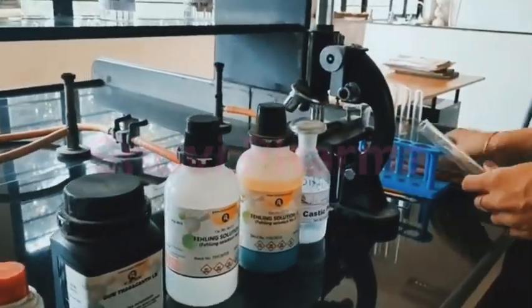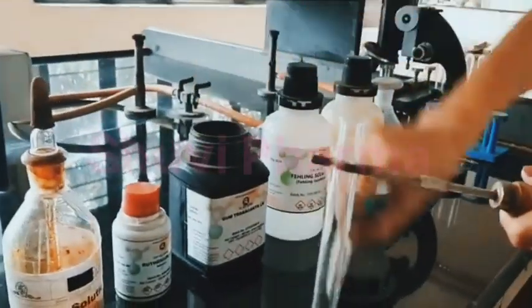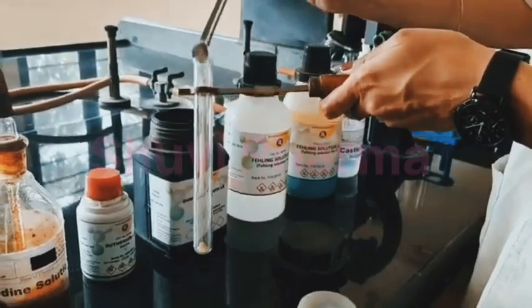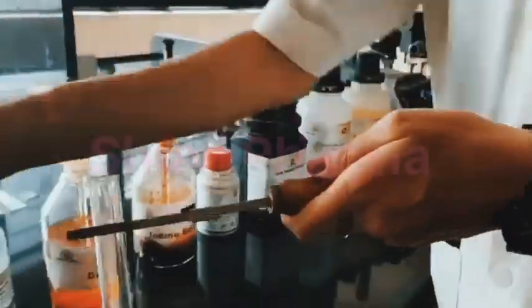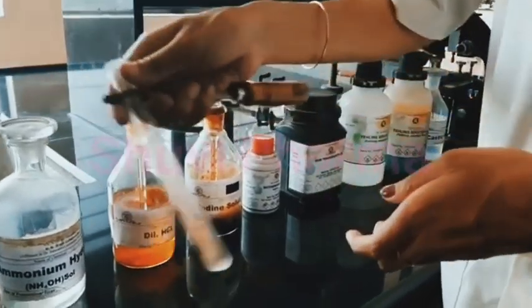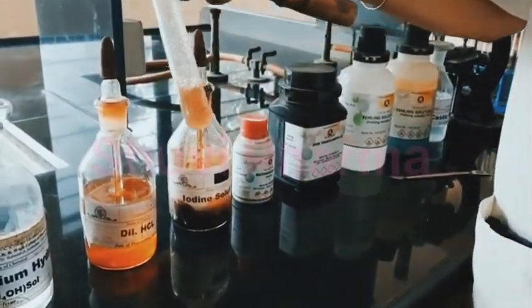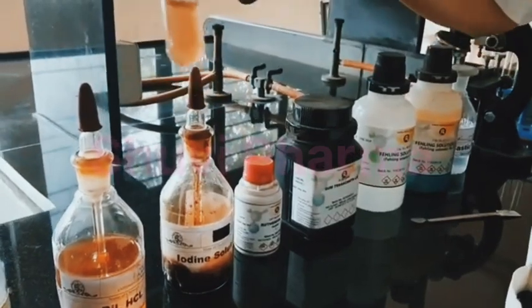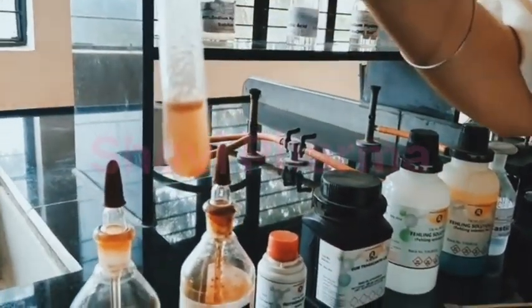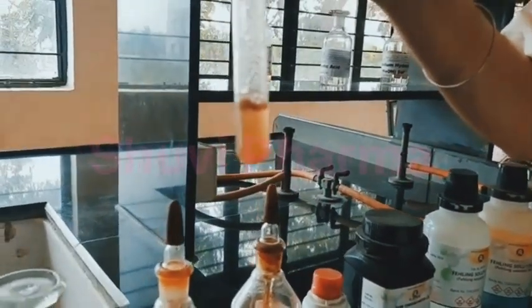Now we will perform the first test, that is solubility. First we will test the solubility in cold water. Here you can see it is not completely soluble, it is partially soluble, and then the powder starts swelling, so it indicates the presence of tragacanth.